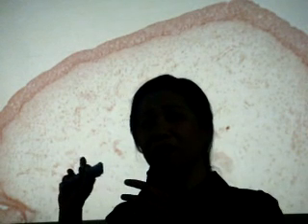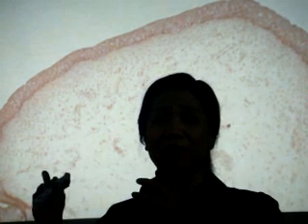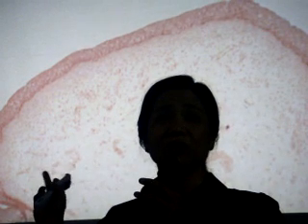Can you identify the epithelium from this magnification? Actually, hindi. Kaya lang alam ko, urinary bladder yan eh, di ba? Ganyan ang itsura ng slide nyo. Pero if you're under that magnification, you cannot say that it's, alam ko, stratified. But I do not know if it's squamous or transitional, right? Okay. Oh. Ganda, di ba?